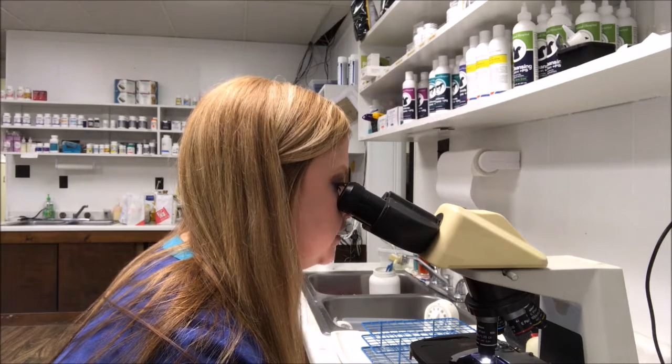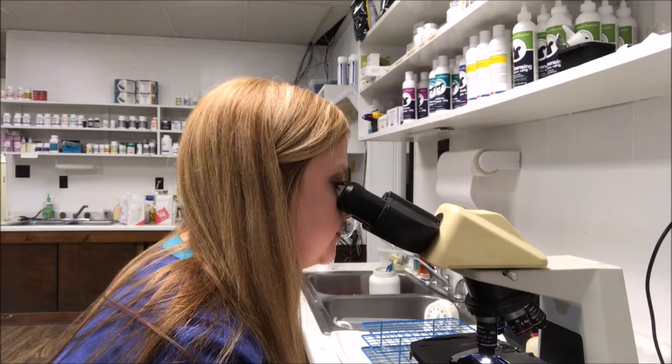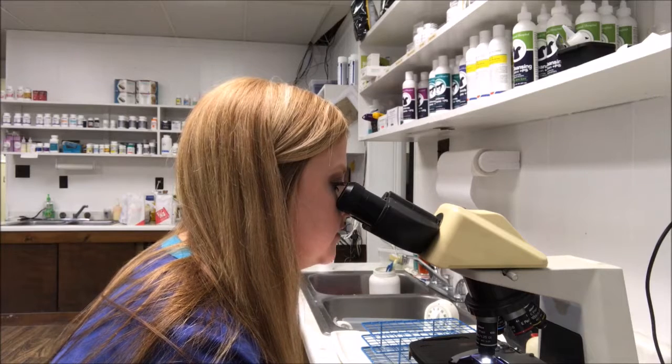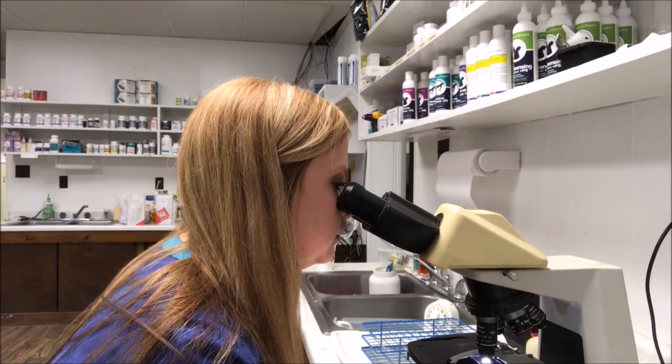These are some really good examples of parabasal cells. They're very round and you can see the nucleus really well.